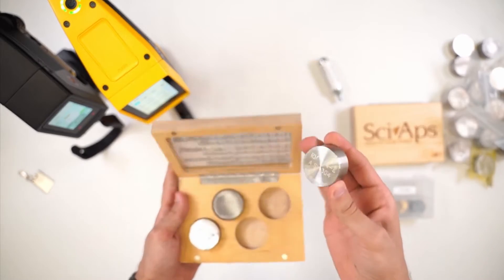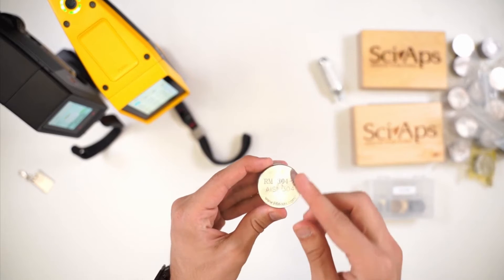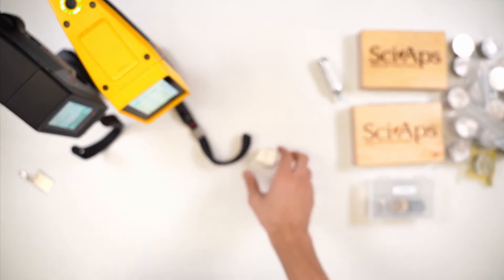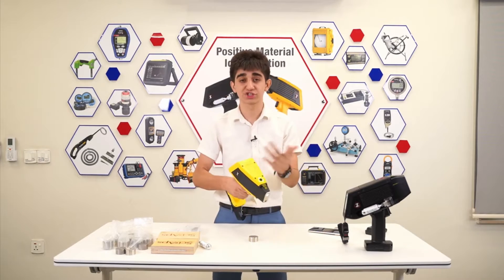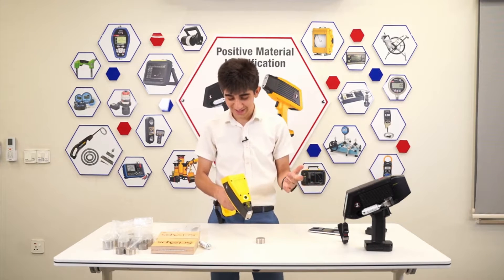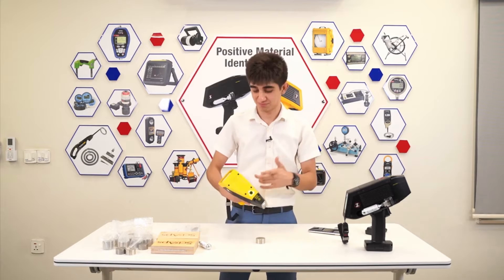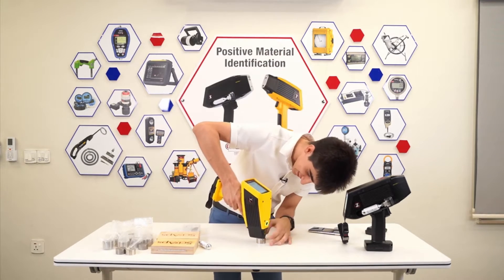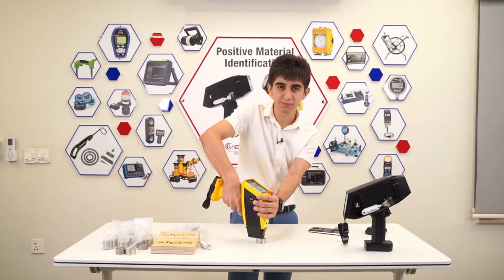From here, let's choose this one, which is the 304 block. Let's put this here and start the test. Starting the test is as easy as putting the unit on it and just pressing the trigger. Let me put the unit there and press the trigger.